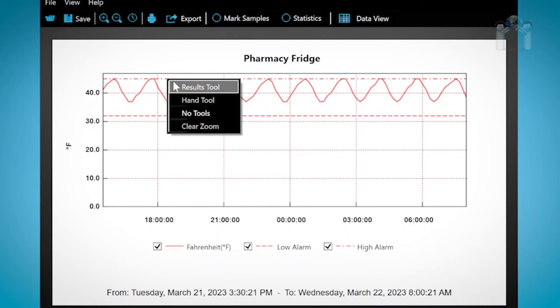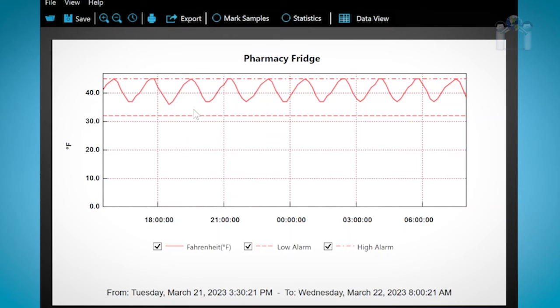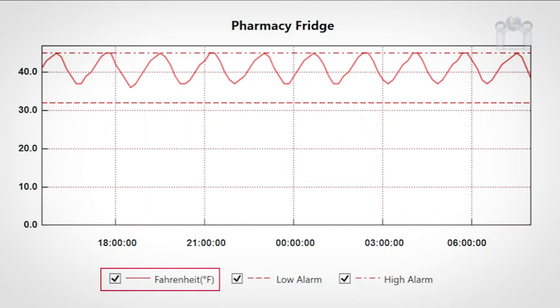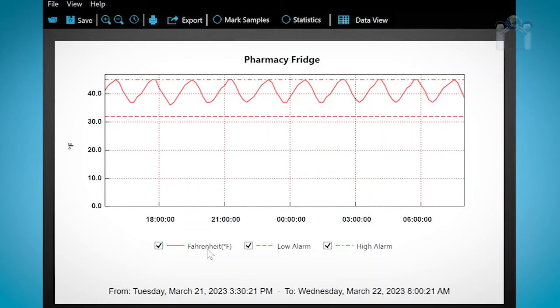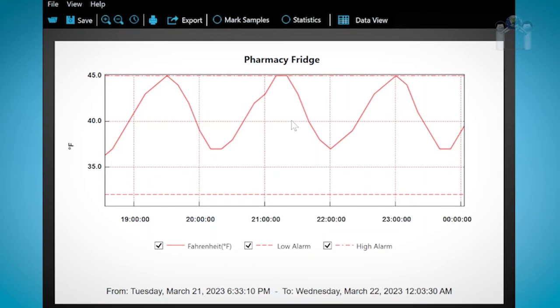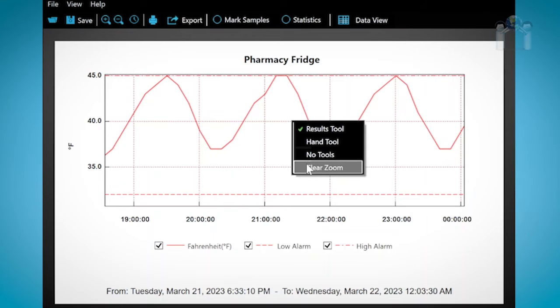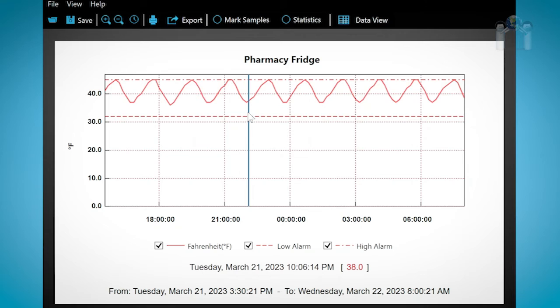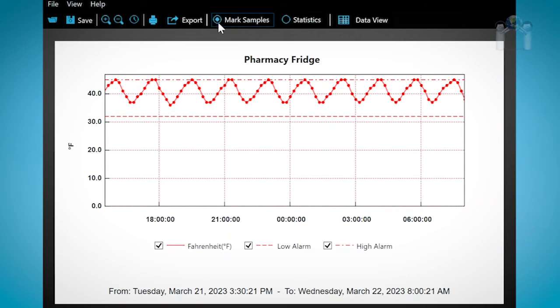If you don't wish to see this data, you can right-click on the mouse and select No Tools. Clicking on Result Tools will restore the view. Below the graph, you will see the graph legends with a checkbox for Fahrenheit, Low Alarm, and High Alarm. If you uncheck the box next to the name of the legend, that line will be removed from the graph. Checking the box again will restore it. You can select a range to close in on by creating a box around a selected area, and you can return to normal viewing by right-clicking and selecting Clear Zoom, or by clicking the magnifying glass with a minus sign. Click on Mark Samples and you will see dots appear on the solid line — each dot represents the moment the data logger recorded a reading. Clicking the option again removes the dots.